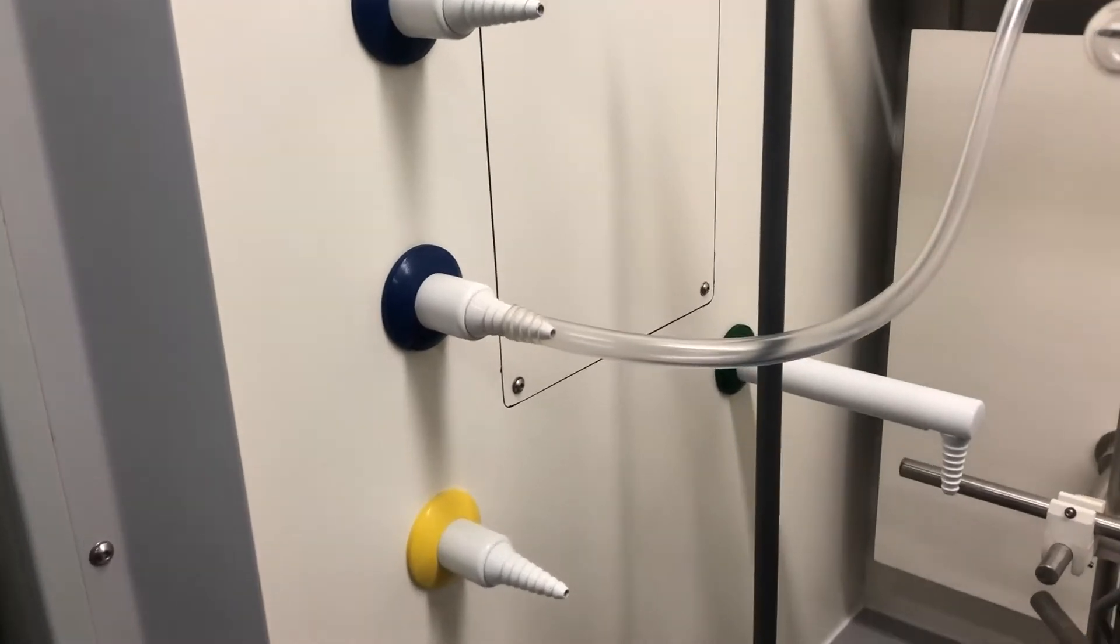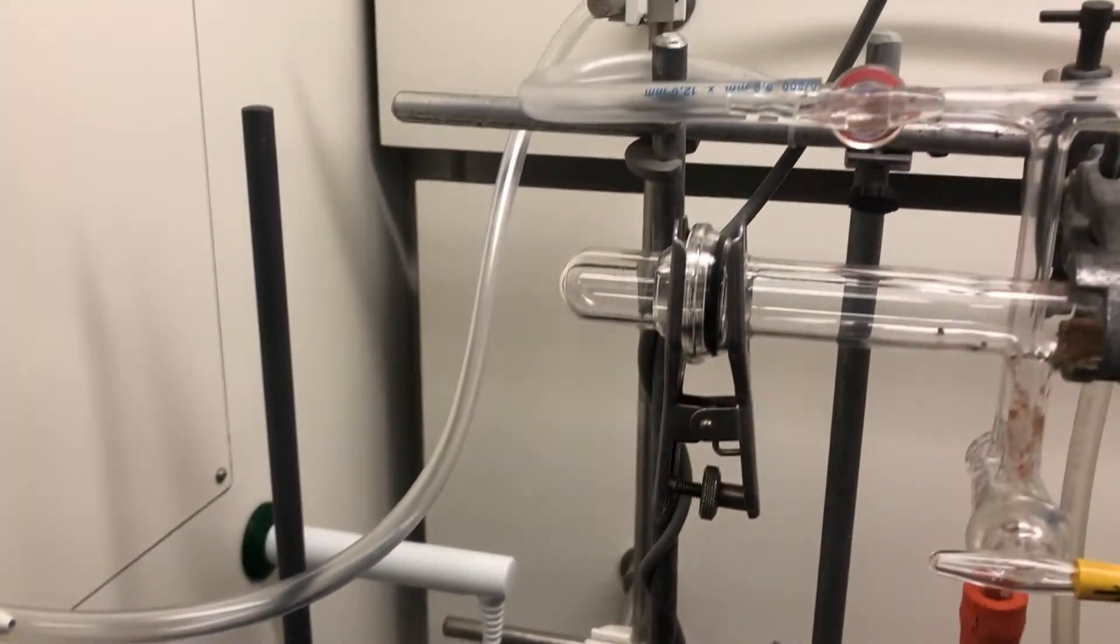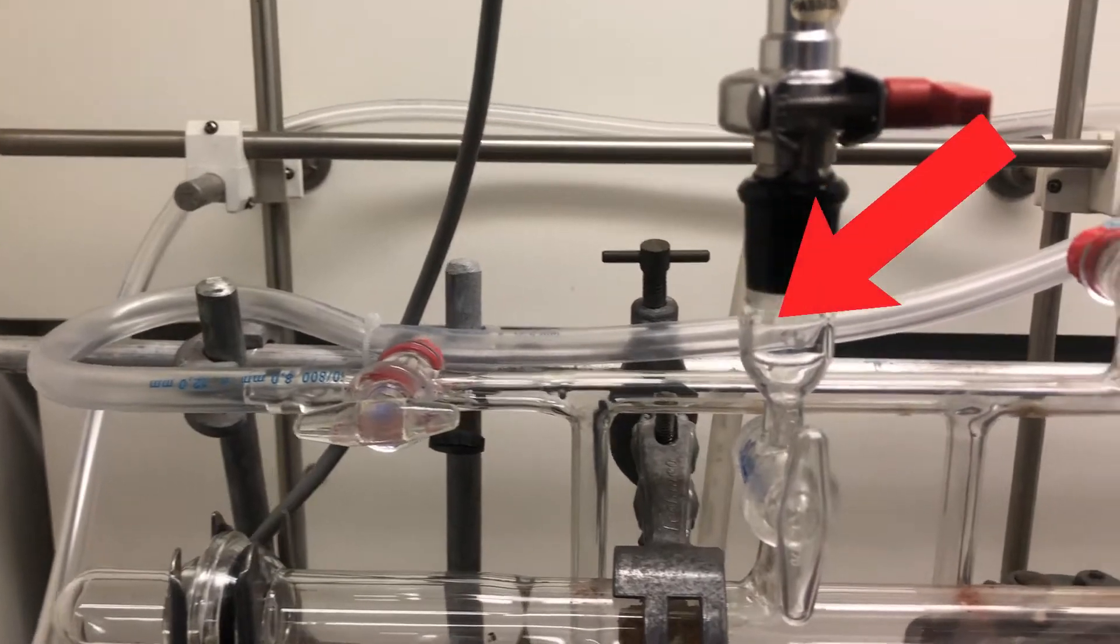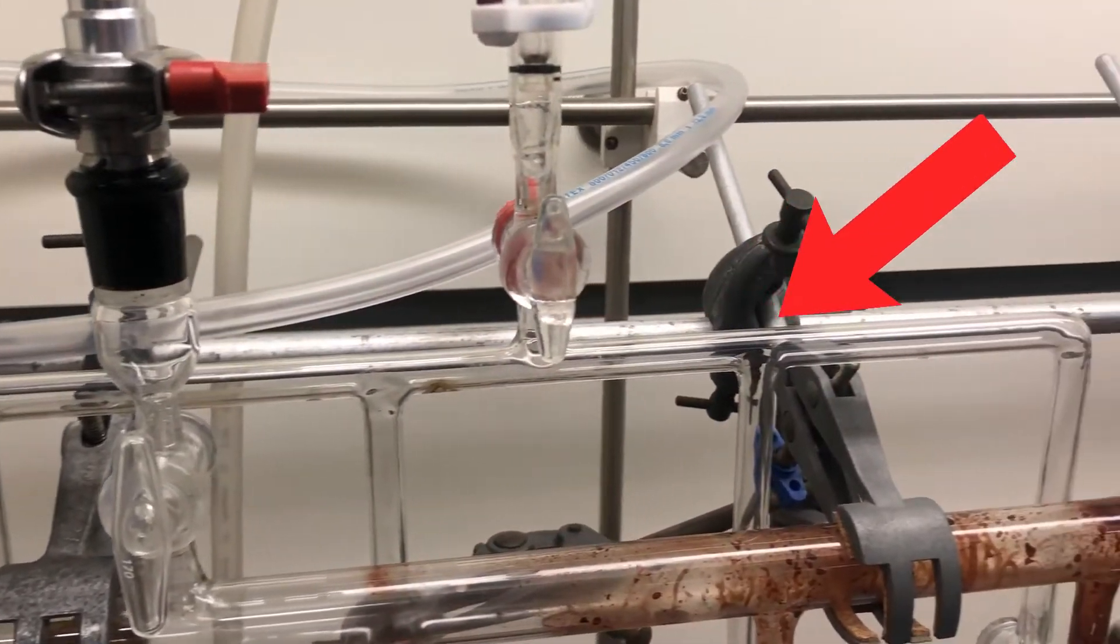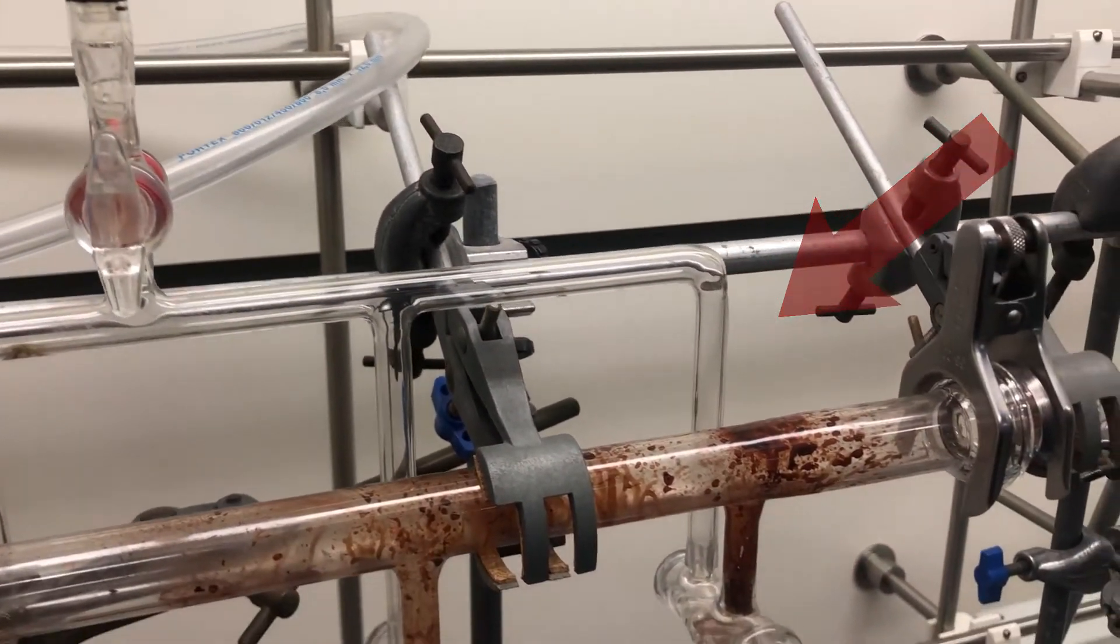It's attached to our nitrogen tap, comes above our vacuum line, and has nitrogen flowing in and around it that we can connect up to our system to backfill with the inert gas.